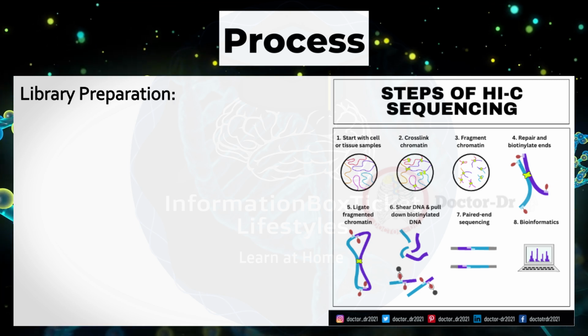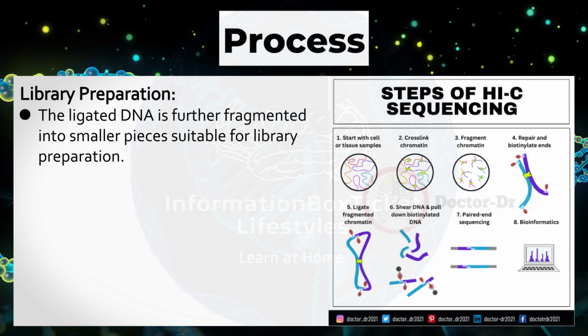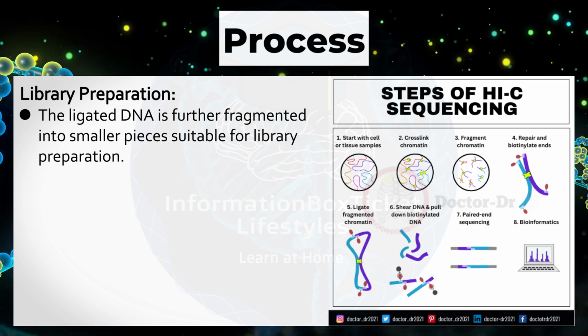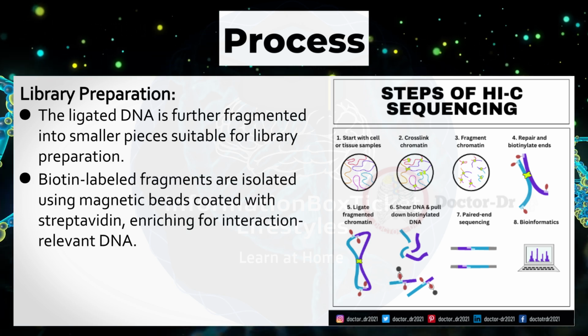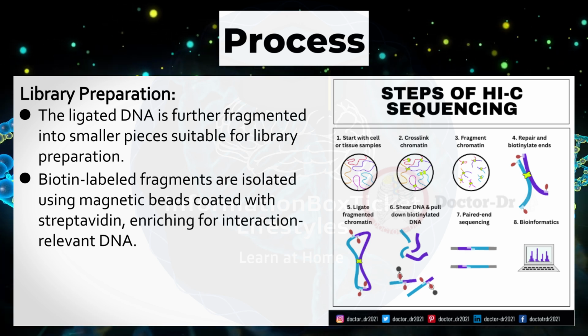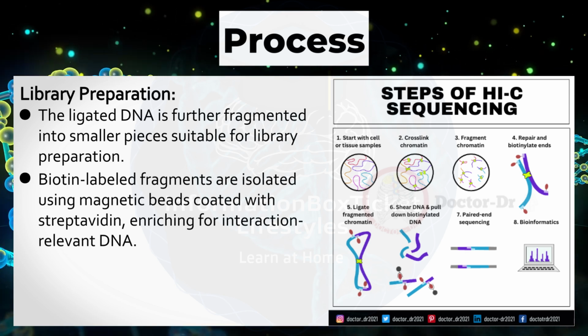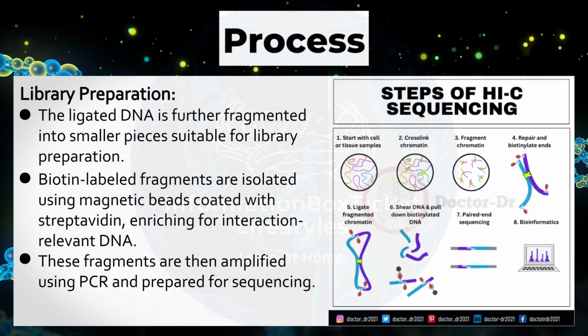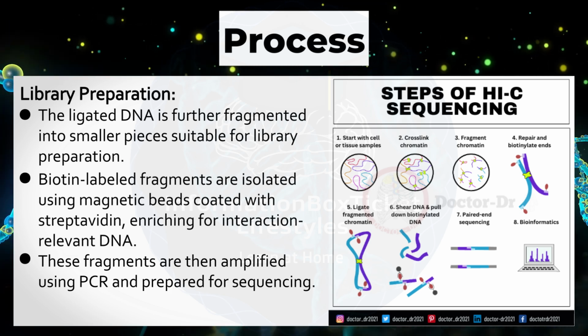Library preparation. The ligated DNA is further fragmented into smaller pieces suitable for library preparation. Biotin-labeled fragments are isolated using magnetic beads coated with streptavidin, enriching for interaction-relevant DNA. These fragments are then amplified using PCR and prepared for sequencing.